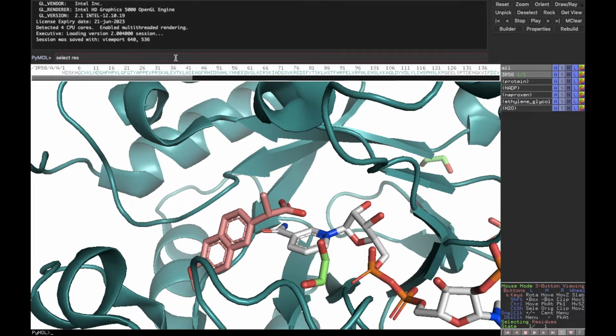So instead we're going to replace this with RESI, which is residue identifier. And we're going to follow this with just the number 117, and we can include as many numbers as we would like that correspond to as many residues as we would like to select. And so we'll follow it with a plus symbol, as well as the second number for tyrosine 55. And if we enter this command right now, it would work. It would generate a default selection named SELE in our sidebar here that selected both histidine 117 and tyrosine 55.